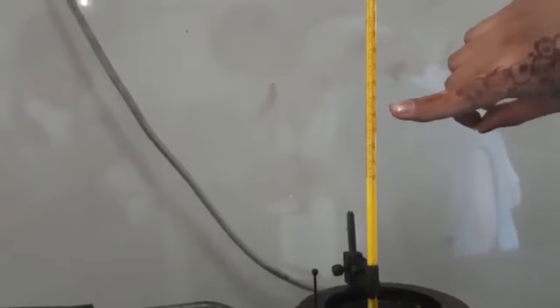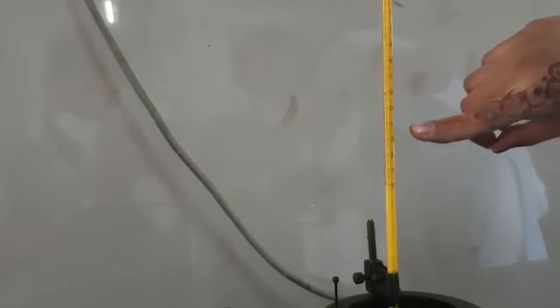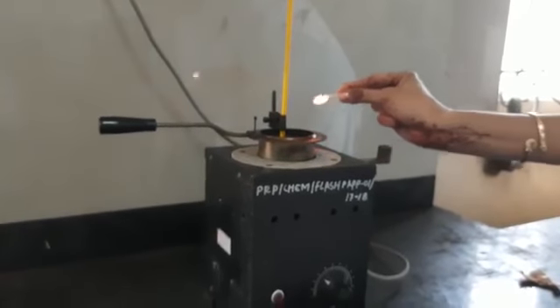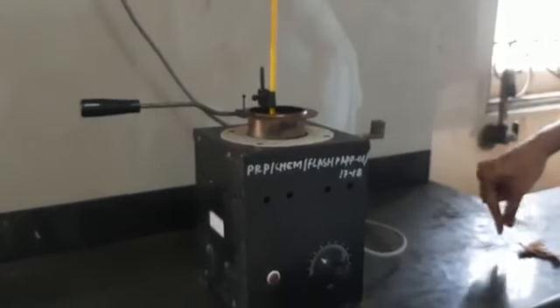We are going to increase the temperature to 55 degrees Celsius and then check whether the given liquid oil is catching fire or not. So at 30 degrees no flash, no fire.